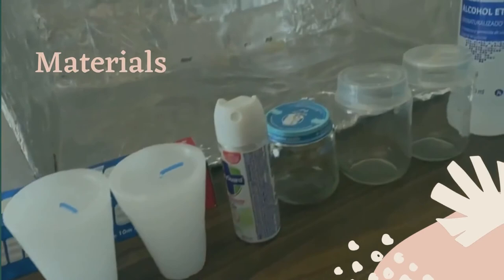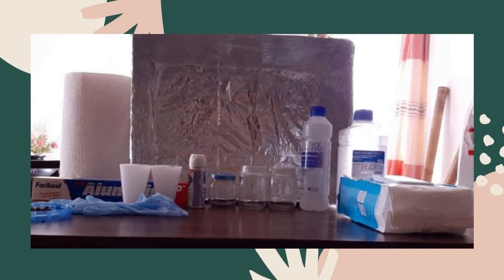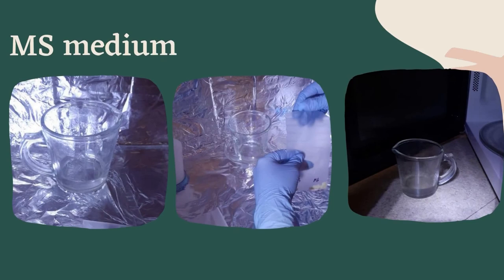I also used candles, alcohol at 70%, 4 flasks, distilled water, chlorine, gloves, a face mask, and the ingredients to make the medium. I used 2 different mediums. One was with agar and MS medium, and the other one was with a thiamine tablet, banana, and distilled water. First, I did the MS medium.